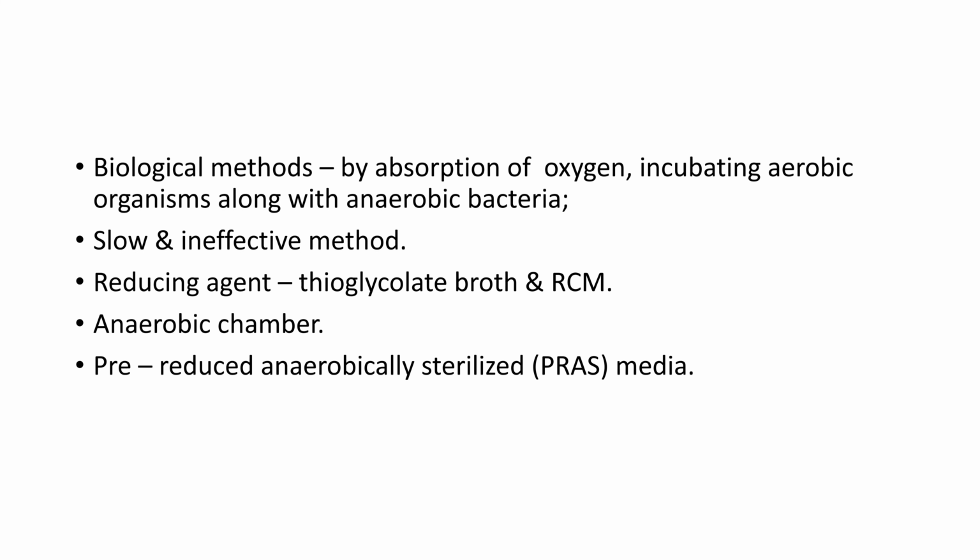The other method is the anaerobic chamber, and last but not the least is pre-reduced anaerobic sterilized media, that is also PRAS.